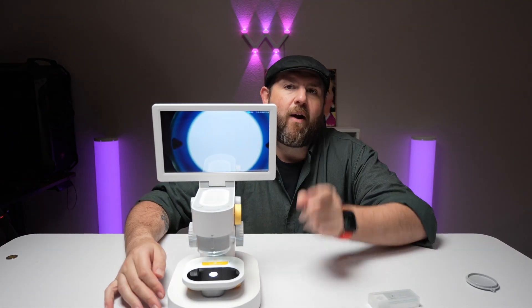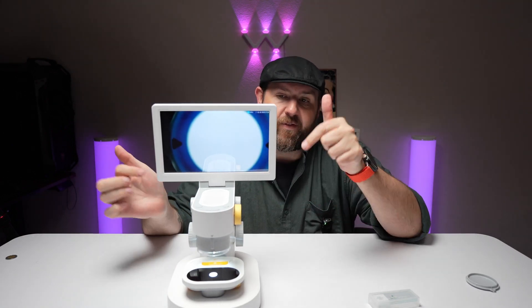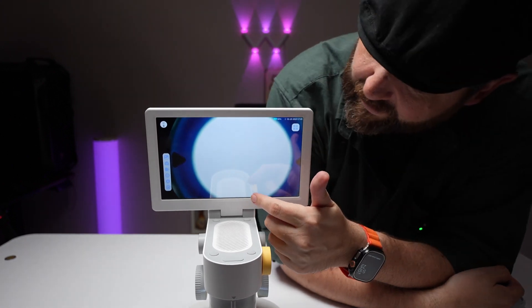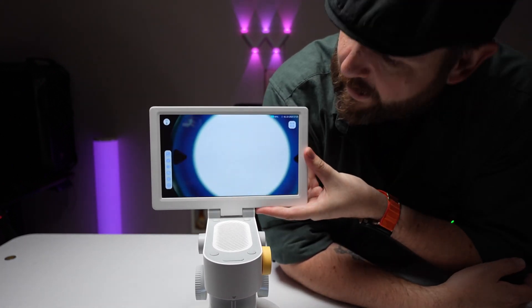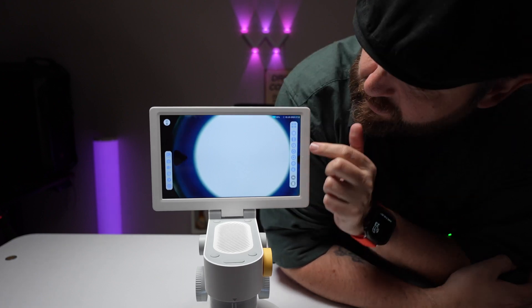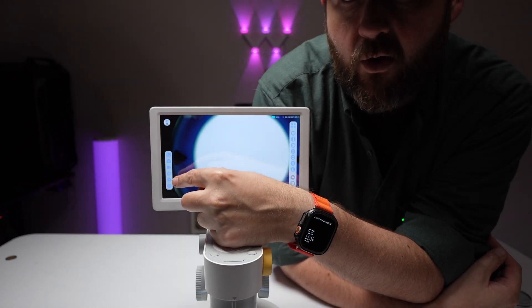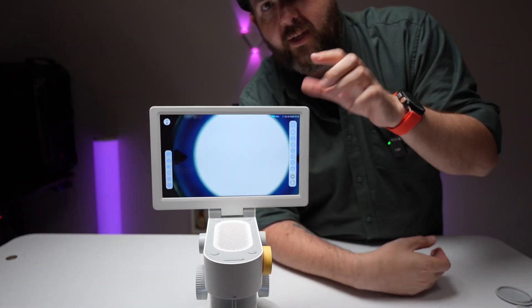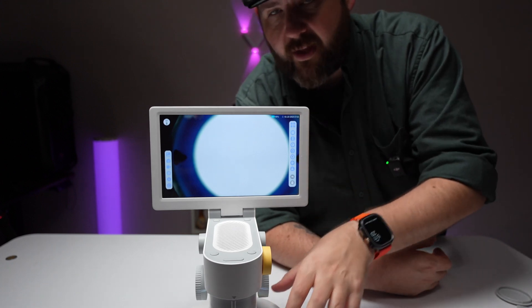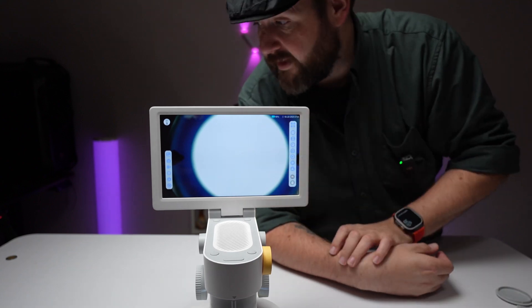I'm going to flip this around so we can see the camera a little bit better. This has 32 gigabytes built in for the memory for this model. Also this screen is touch screen, so we'll go ahead and hit it — we've got some settings that will pop up. There's a little square here you can click, and then you can make some different changes for the settings. You can also take pictures, take video, and it will record to the internal memory. Plug this into your computer with a USB cord and use it as a mass storage device to access all the videos and photos.